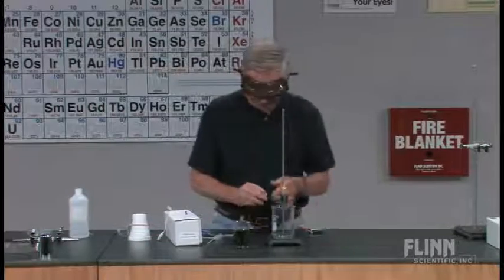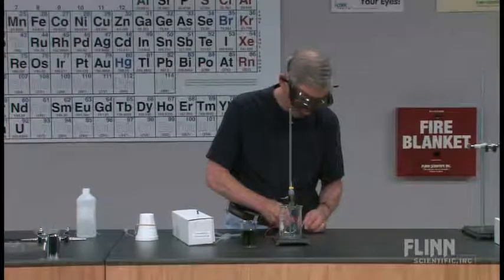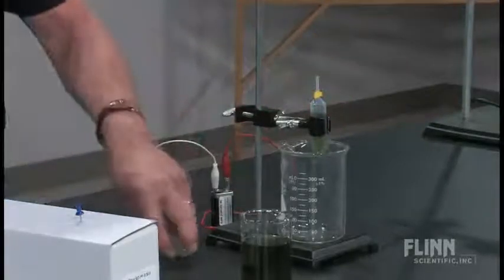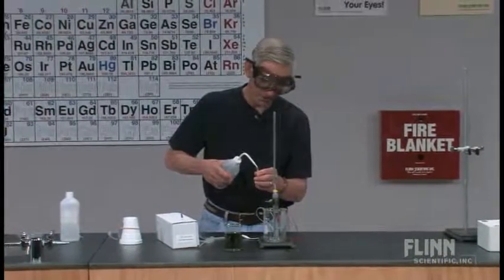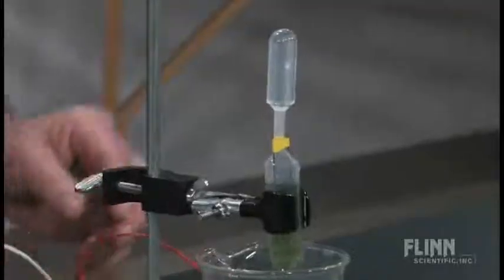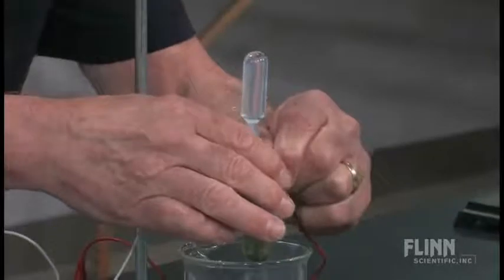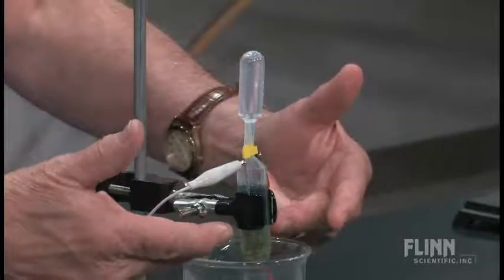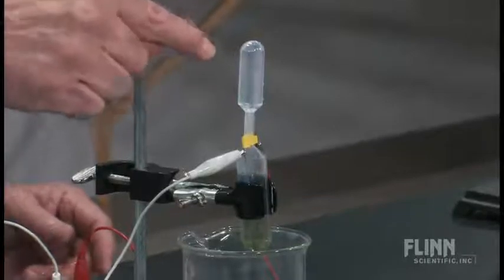I'm going to use the same battery, but I don't need the pencil leads anymore. I'm going to hook up the electrodes to here. I'm going to take my cutoff pipette and some distilled water. Fill that pipette. Hook up the electrodes. Notice the water stays in the pipette bulb. And carry out the electrolysis in one spot. Now both gases are being generated here. Both gases are moving up into here. The 400 milliliter beaker, catch basin. Water that comes out of here has to go somewhere.